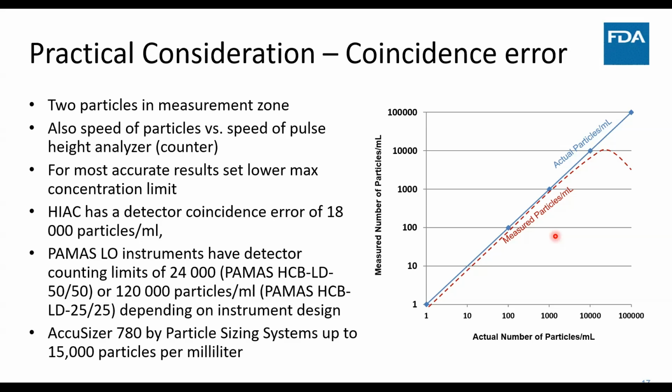So the risk for having this error is quite low. However, when you go to products such as biologics, where there's quite an interesting particle size less than 10 microns, you might run into the issue of having more than 15,000 particles. Sometimes particle count is as high as 10 exponent 5 per ml in a product. And in that instance, this becomes an issue or a challenge, limiting the applicability or usefulness of this particular technique.